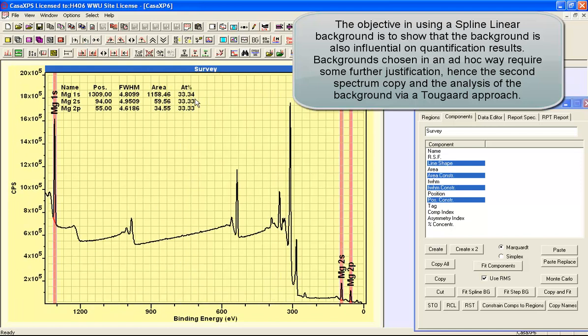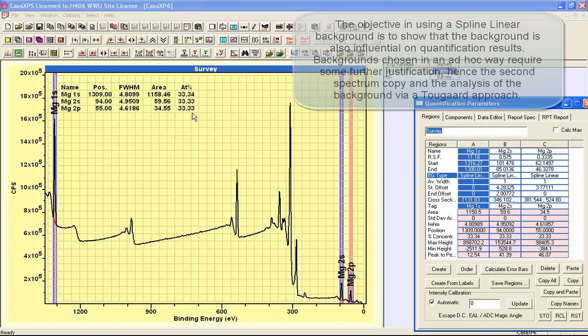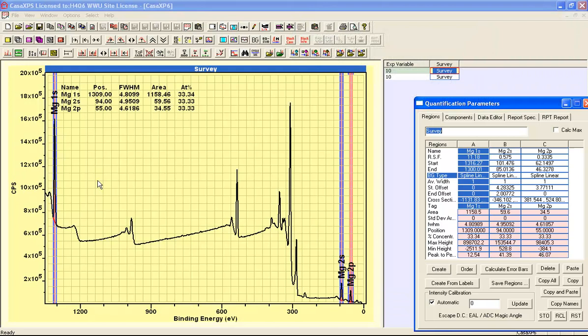And these shapes are required to get a quantification that is what you'd expect, namely 1 to 1 to 1, because these are all from the same material. So we'd expect these peaks, when scaled according to the escape depth, the transmission, and the Schofield cross sections, we would expect these to produce the same amount of magnesium regardless of which one of these peaks that we use.